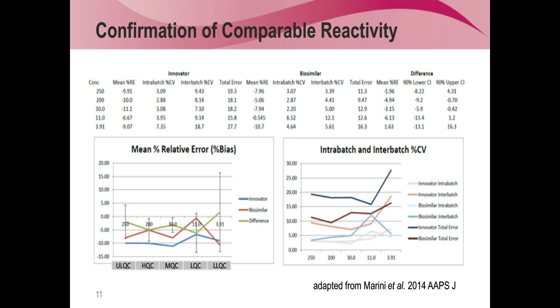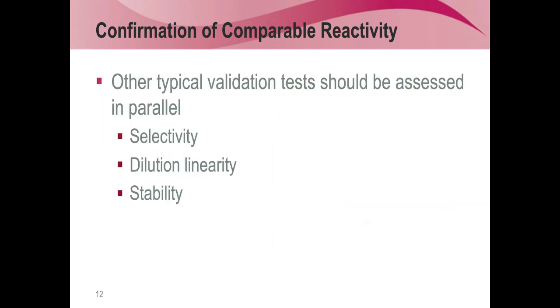And of course, then we do the relatively boring stuff of doing the selectivity of the assay, doing the dilutionality of the assay, doing the stability of the assay. And I think what sets us apart from many other companies, we always do this with both compounds, because what we have gathered from the responses from the authorities is that they really want to see all this information doubled up, even if this is often a relatively simple exercise with not much deviation. Well, this is what you expected. There's not much deviation.